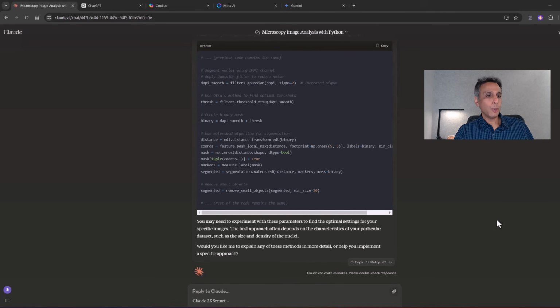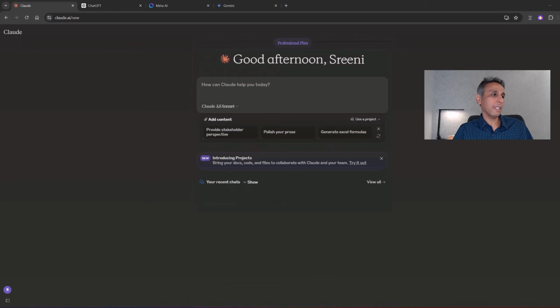Yeah. So now the key problem here is segmentation. If you do threshold-based segmentation, then you have to adjust the sensitivity for thresholding, the smoothing for Gaussian smoothing before you threshold them, and then also the watershed sensitivity and all that. So that's a manual process. This is why deep learning can be very useful, but deep learning, I don't want to train my own models.